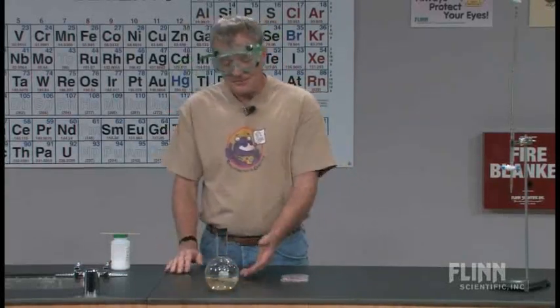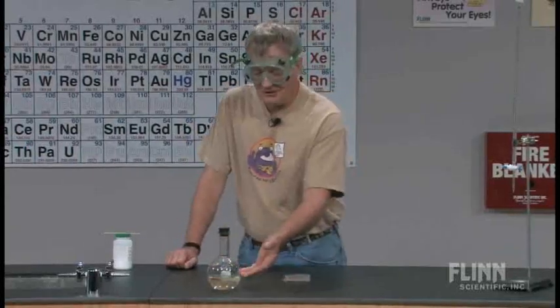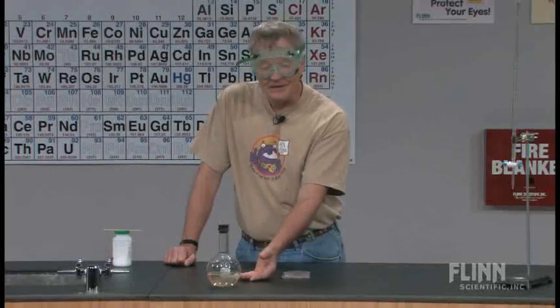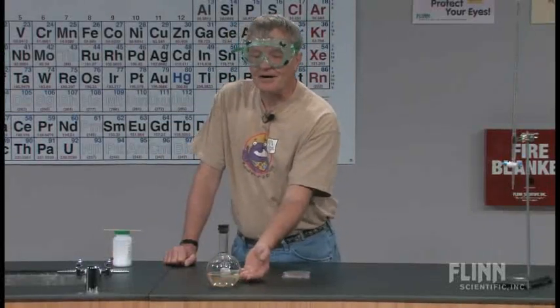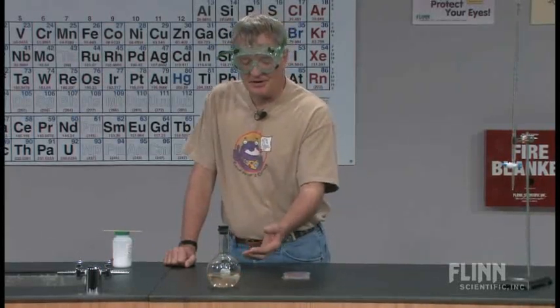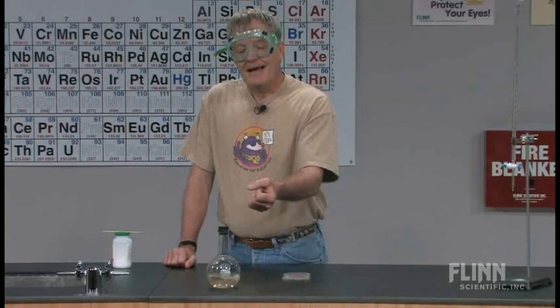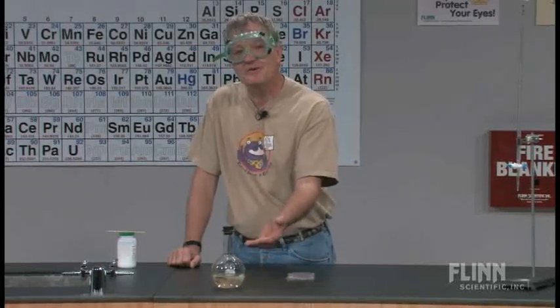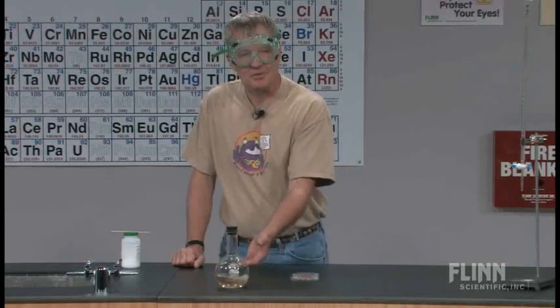What we want to get across is how do you make a supersaturated solution. Generally, it's done by heating a quantity of solid with liquid. You drive the temperature up above the point where all of the solid will dissolve — so you don't have a supersaturated solution yet — then as it cools back off, at the point where it reaches saturation, instead of crystallizing out, it continues to cool back down. Now what you have is actually more material dissolved than the handbook says can be dissolved — consequently the term supersaturated.